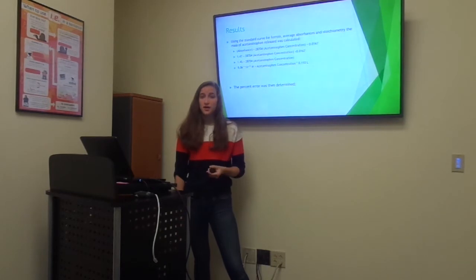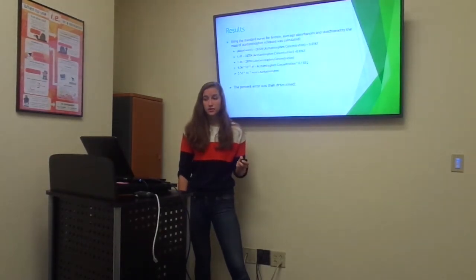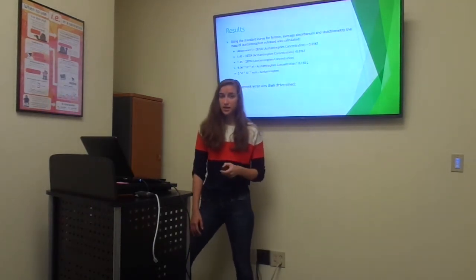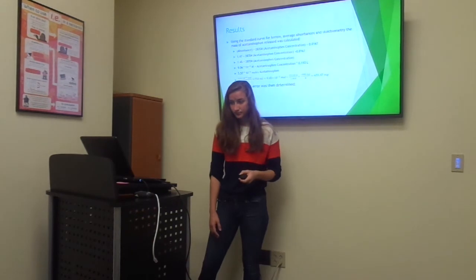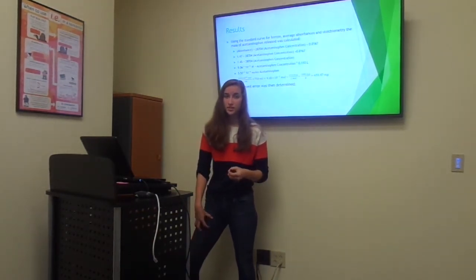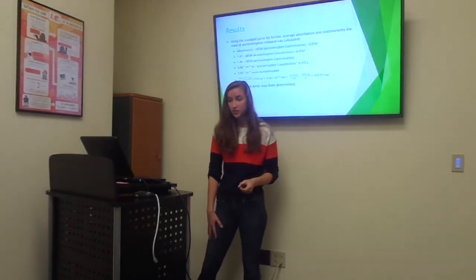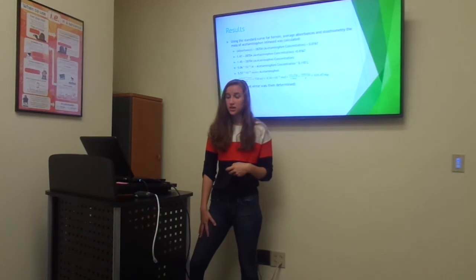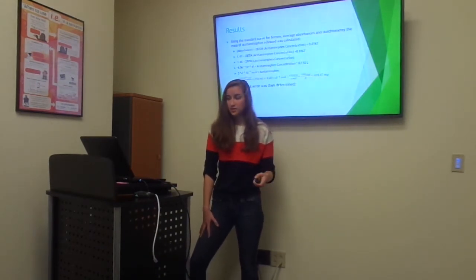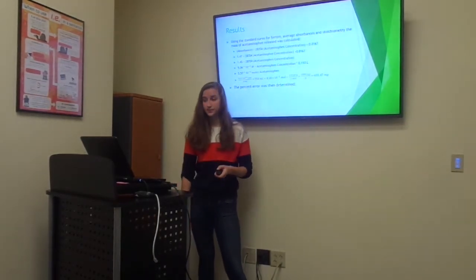This is then multiplied by a diluting factor of 0.11 liters to solve for the moles of acetaminophen released. To convert that into milligrams as the theoretical units, it is multiplied by the total volume, the 700 milliliters of HCl it was released into, and then using the molar mass of acetaminophen and converting it to milligrams, you get the experimental milligrams released.